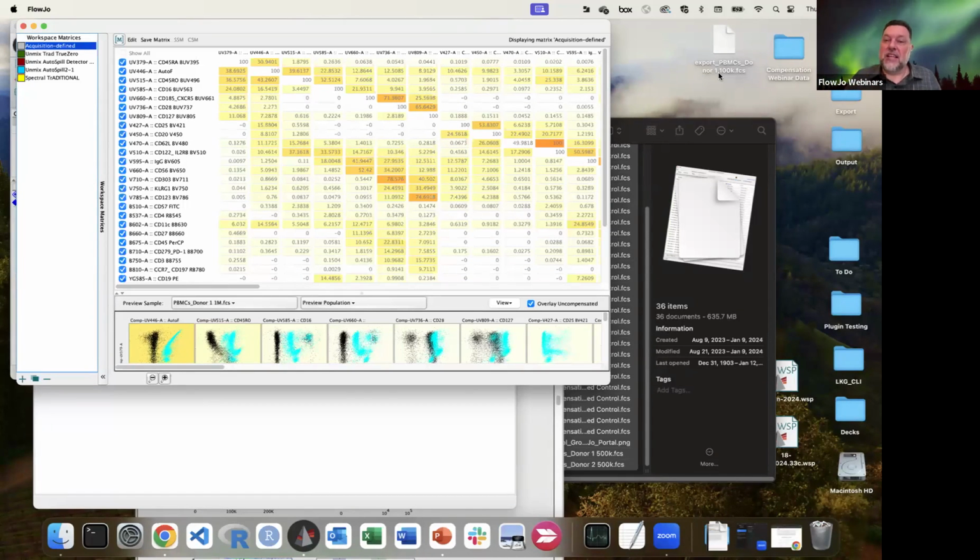Or if you right click and say export as unmixed FCS, then it's like exporting as compensated parameters only in FlowJo. You get only the compensated data, and then you will have a 33 color experiment. It drops all of the unused secondary detectors that were not assigned as primary detectors for each fluorochrome. And it's a simpler way to do it, right? Then you slap on a matrix of zeros in FlowJo, and you can still edit those one-to-one interactions.